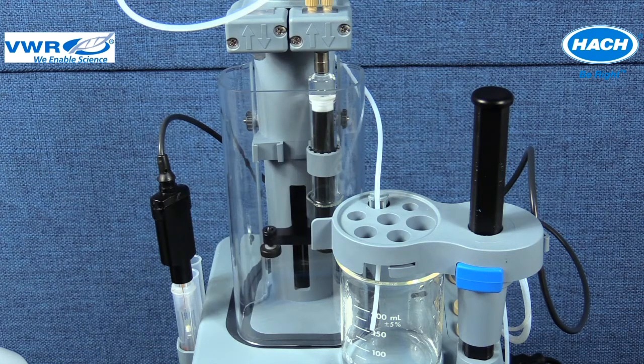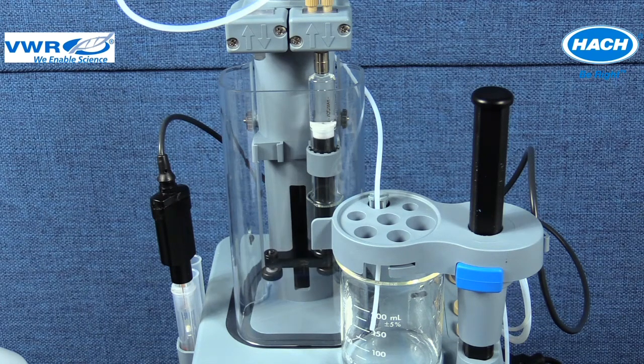If there were two syringes connected, the internal valve in the other syringe's position is closed, and the titrant solution would only fill the syringe and flow back to the titrant bottle. The closed valve would prohibit the solution in the syringe from dispensing into the sample beaker.